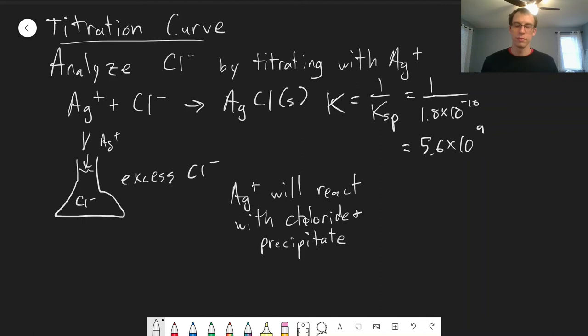And we keep adding more silver until all the chloride has reacted.